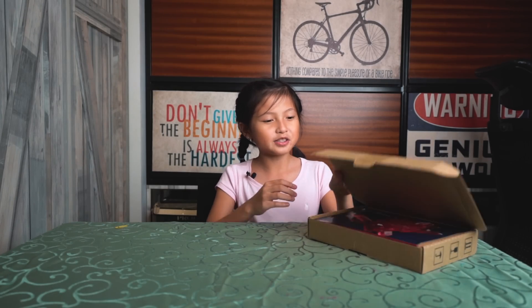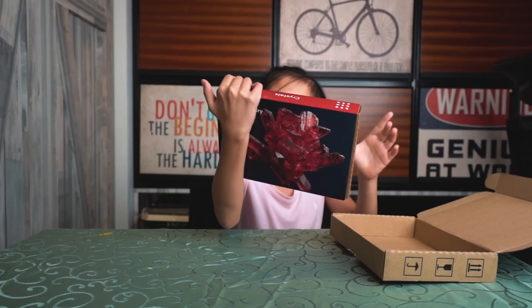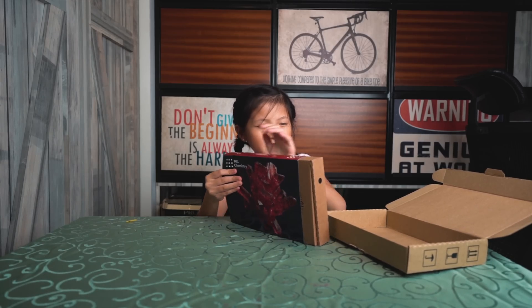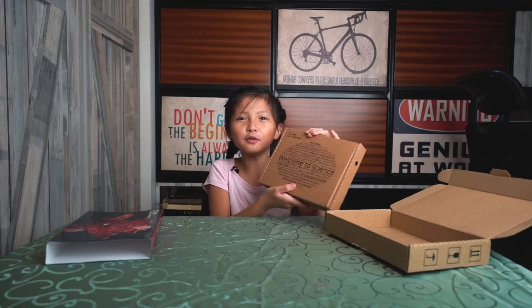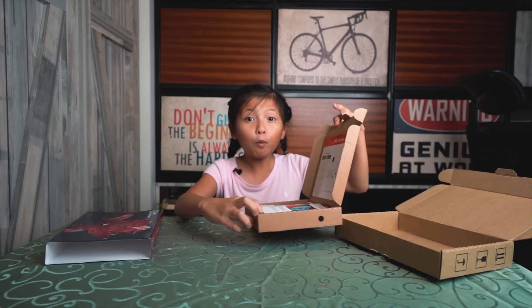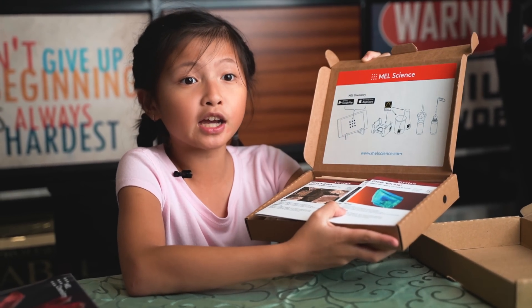Hello, my name is Jamie Herra and today I will be making crystals. This looks very interesting. I wonder what's inside here. Wow, there are so many experiments I can do.